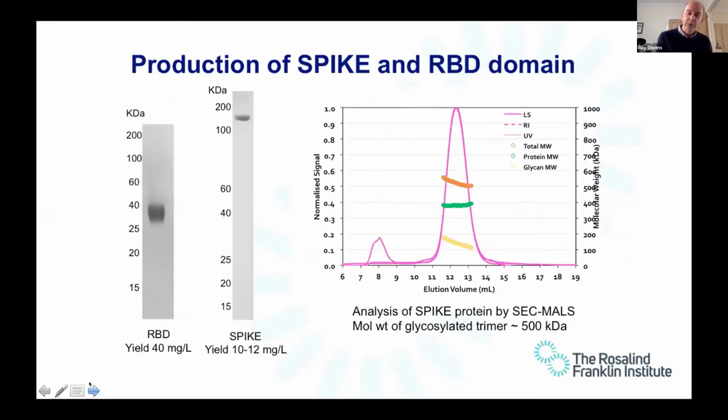Another key thing, apart from having the workflows to generate these reagents, is obviously having the antigens to put into the system. I just thought, as a protein production person, I'd name check on this: the two reagents we've been working with primarily are the receptor binding domain, which you've heard about, and the full spike protein. Going back to March, and I think Dave would agree, a lot of work went in, both in my lab and Struwe's, to work out how to make good quality protein.